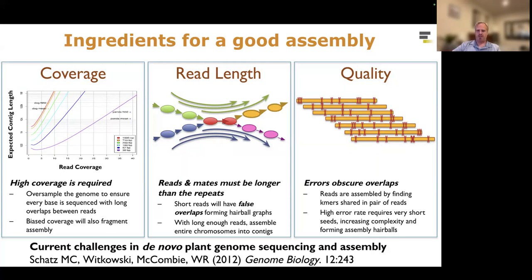Fortunately, in the modern era, the platforms that are most relevant, Illumina sequencing, PacBio HiFi, Oxford Nanopore sequencing, have a relatively low error rate. In the case of, say, Illumina, we're talking about less than 1%. HiFi reads also less than 1%. For Oxford Nanopore, the modal accuracy will be maybe 1 or 2% error, although some of the reads will have 5% error that will need some strategy to accommodate for those.